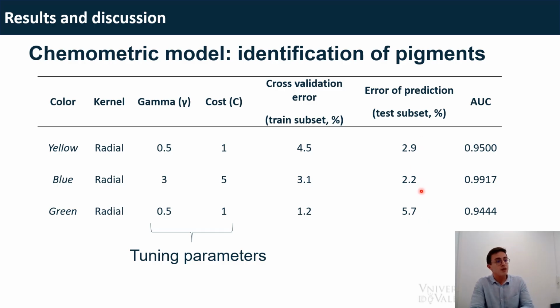This means that the classification using this smartphone-based method will always work better than what we would do with the naked eye. If we had to classify a spot of a wall painting, only saying this is red enough, and this should then be, I don't know, hematite, we will fail way more times than this objective model.